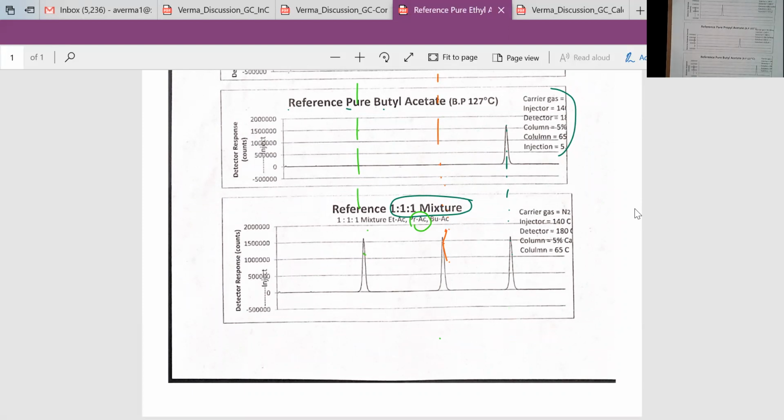And in a different spectra, let's say I have these peaks, not even exactly where they are. You can know the last two peaks are present, but the first peak is missing. So in this particular spectra, there are only two compounds. Where's the third compound? It is missing or absent. Which one is absent? You can also figure that out by just looking at the spectra.